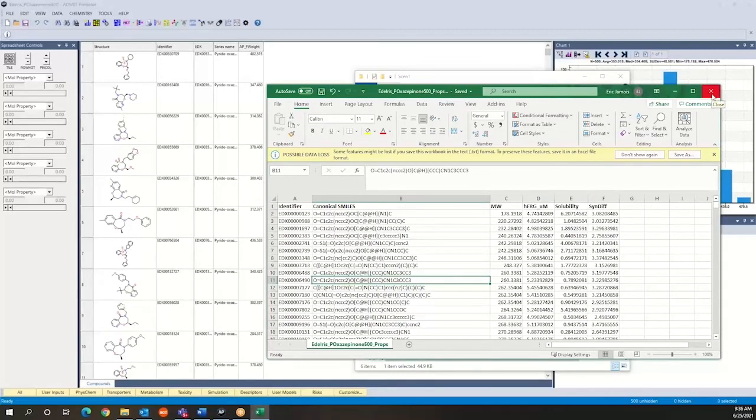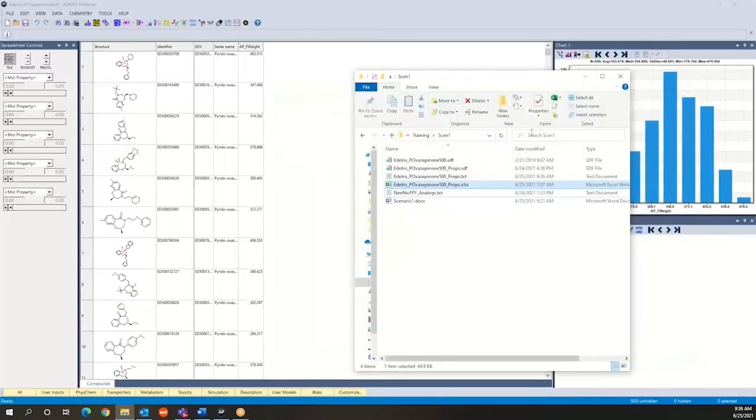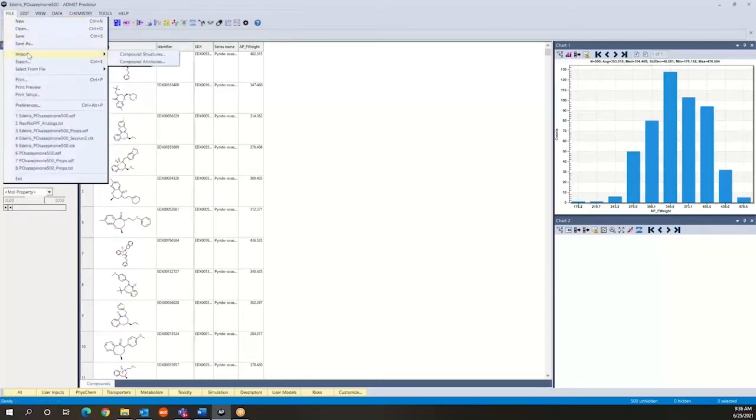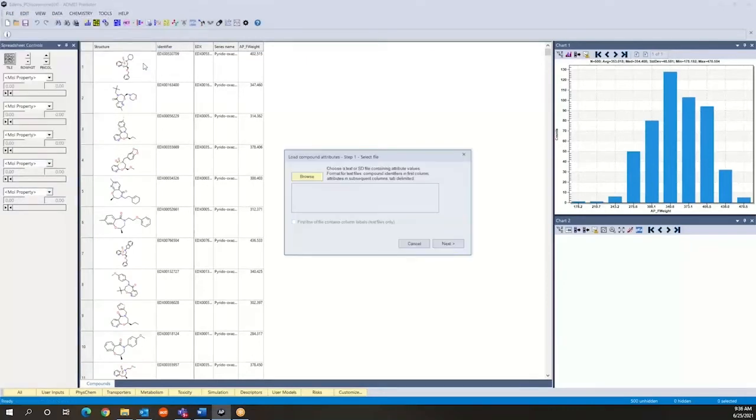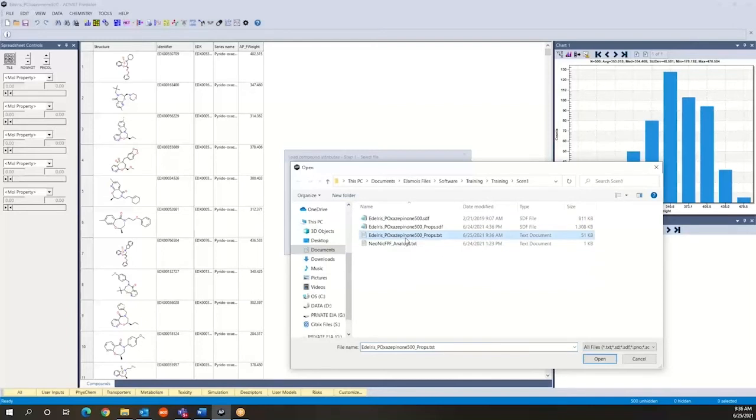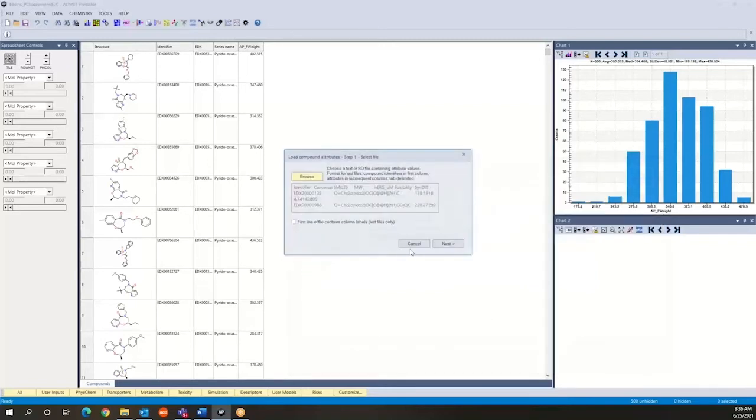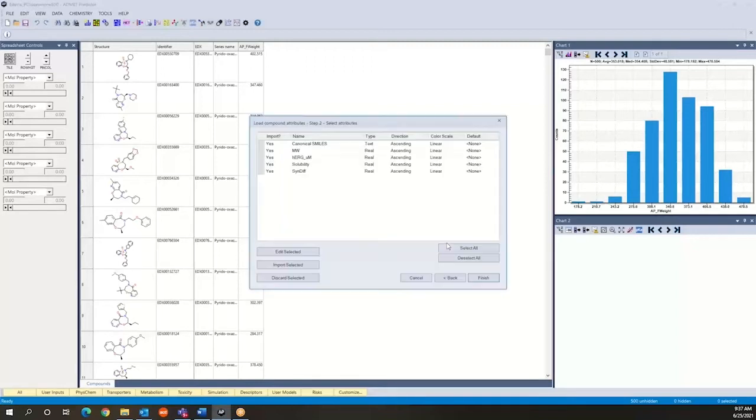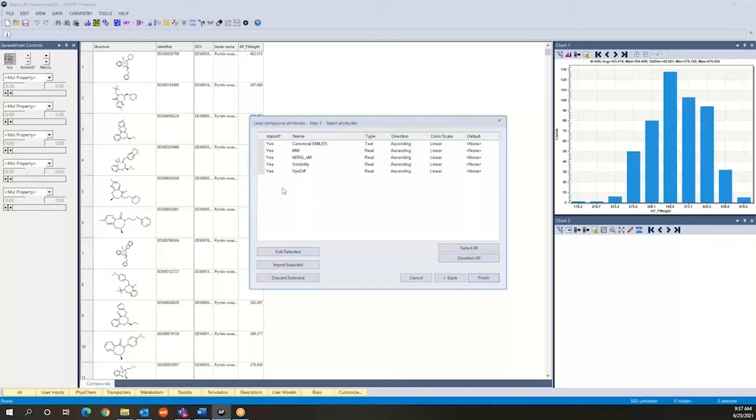And what we can do at this stage is bring in these properties again in a way that is indexed on the identifier. So the way to do this on the file, there's an option which is import compound attributes. Okay, and here we're going to browse, select the file that we exported from Excel which contains the properties and the identifier to do the matchmaking. Okay, our first line in the file contains the column labels. So the identifier, canonical smiles, etc. So we have to click this so the program understands that the first line is not to be taken. And then we have the list of fields that are available to us for import.